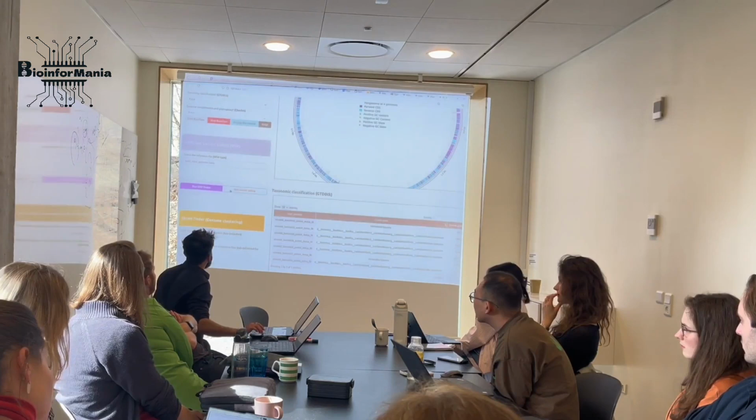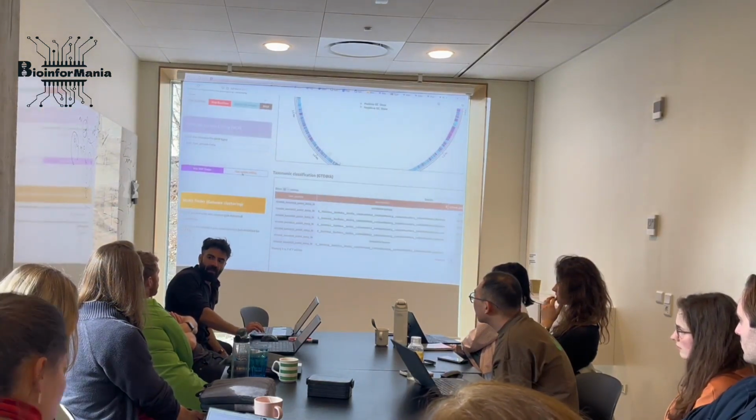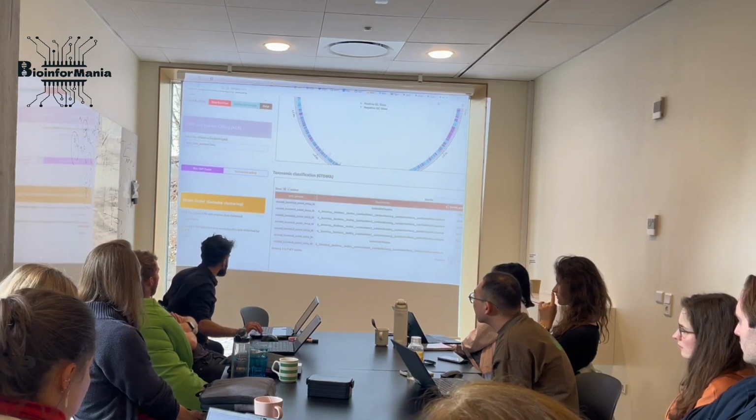Does it annotate the variants? Yeah, it does actually. It's just basically a variant calling file, so you have it at the end.